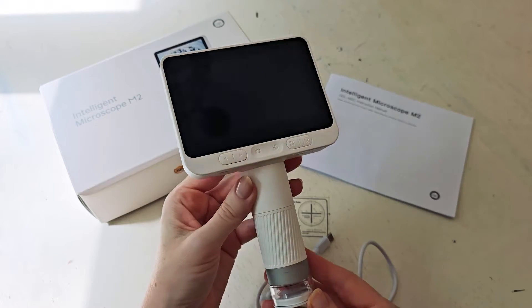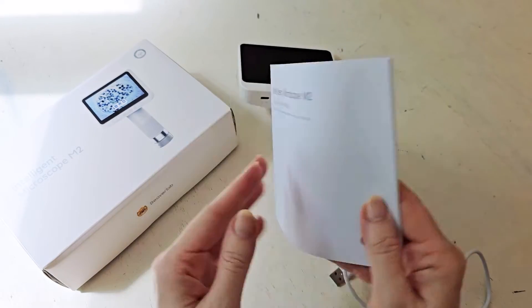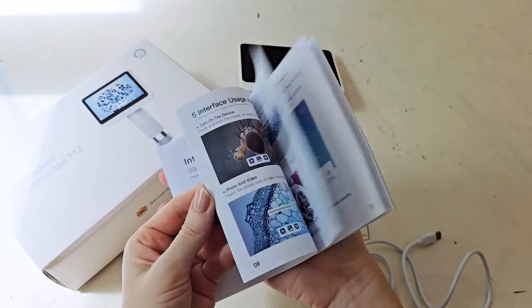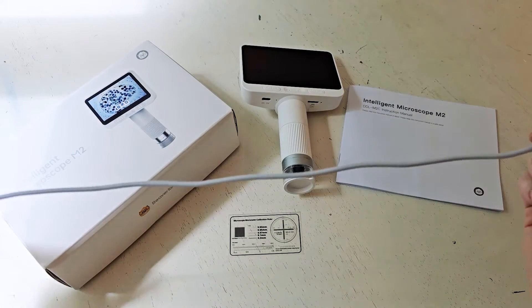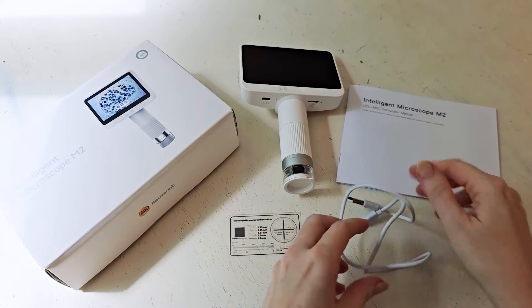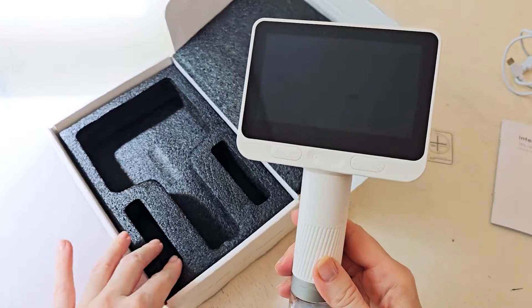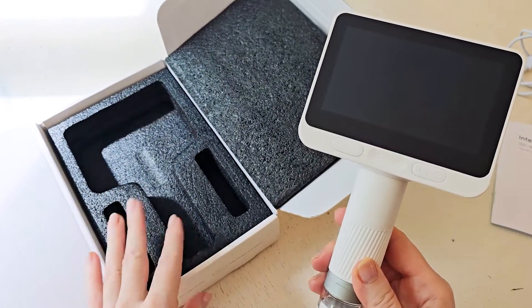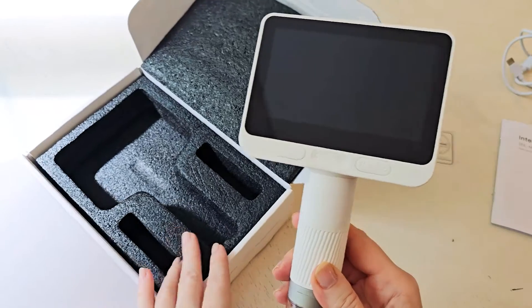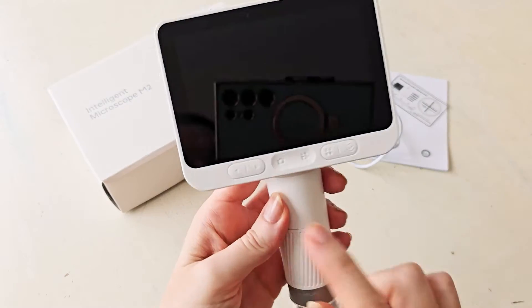The box itself is really well done. Everything that you need is inside — you've got the unit itself, the instructions, and the power cord. The box itself has a lot of time and energy spent on its packaging, and there's tons of foam inside. It's really insulated and very well protected. The whole thing shows a lot of attention and care was taken with this product.